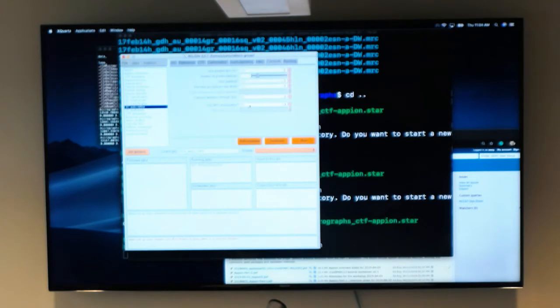But the main point here is if you have GPUs, you want to say GPU acceleration yes. A reminder, we have 2 GPUs, so we're actually going to put 3. One is the master node that's going to send commands out, and 2 would be the workers, which are the 2 GPUs you have in your instance. So if you're running certain features in GPUs, then you just want to make sure in your compute tab you do select GPU acceleration, and then you select 3 MPI processes.